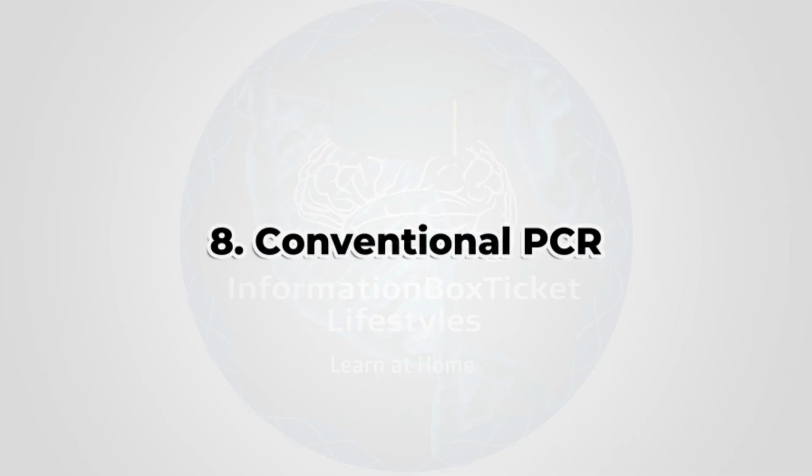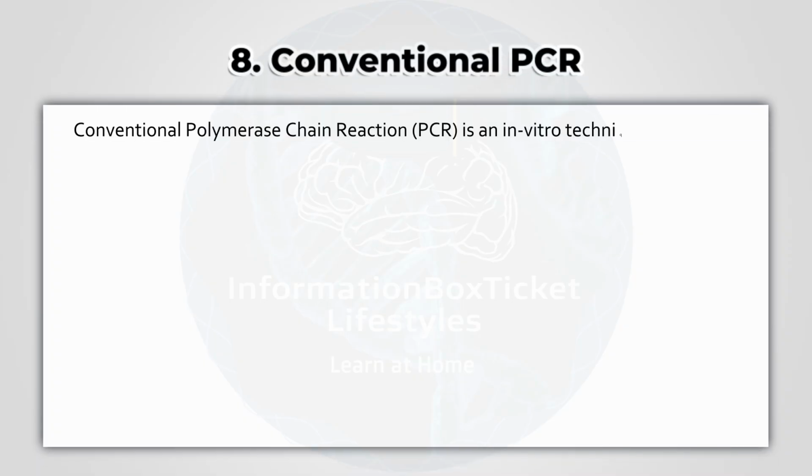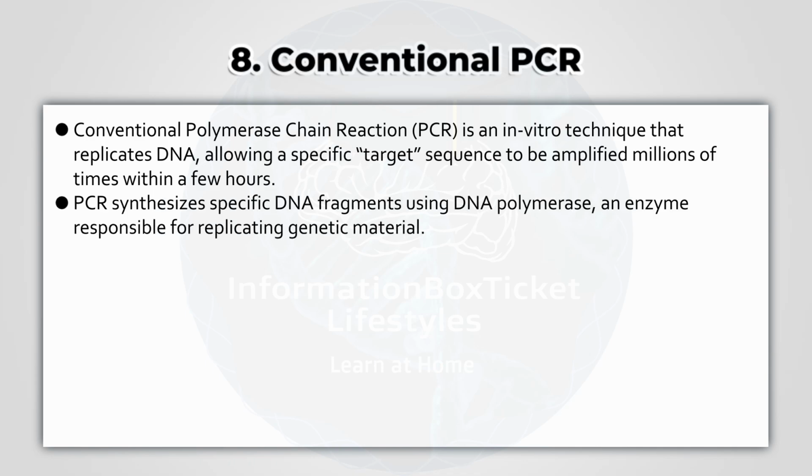8. Conventional PCR. Conventional polymerase chain reaction (PCR) is an in vitro technique that replicates DNA, allowing a specific target sequence to be amplified millions of times within a few hours. PCR synthesizes specific DNA fragments using DNA polymerase, an enzyme responsible for replicating genetic material.